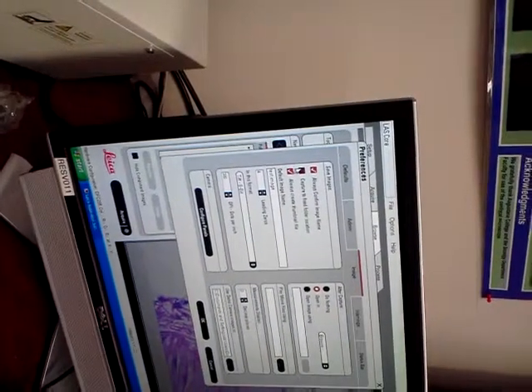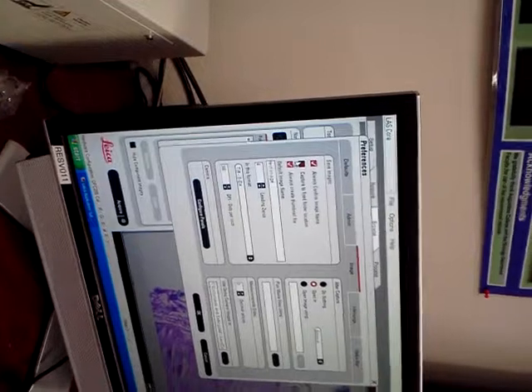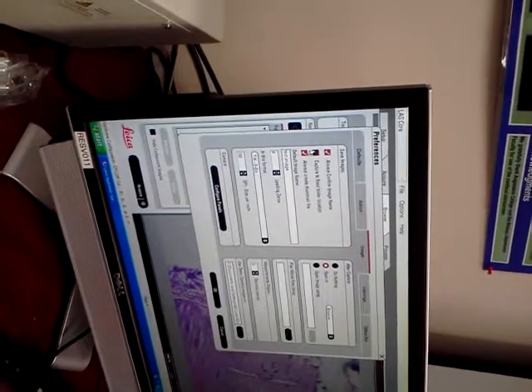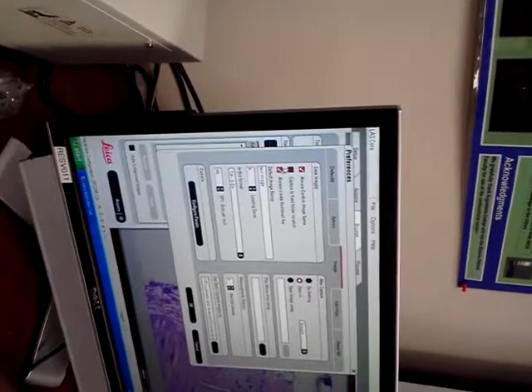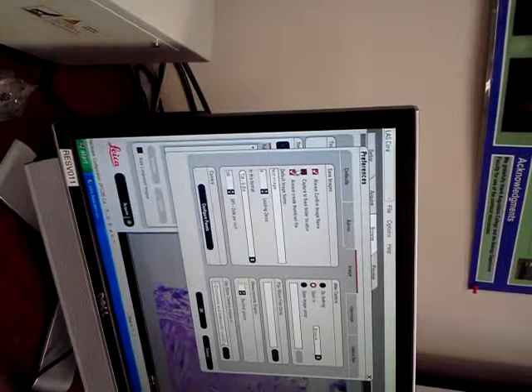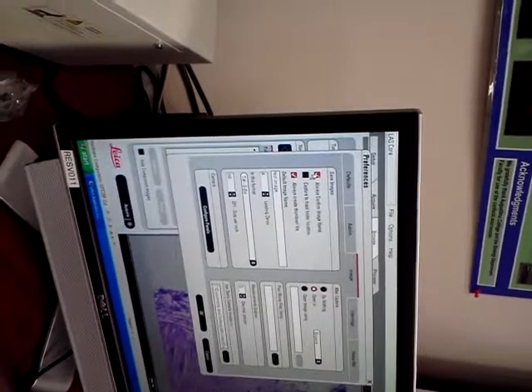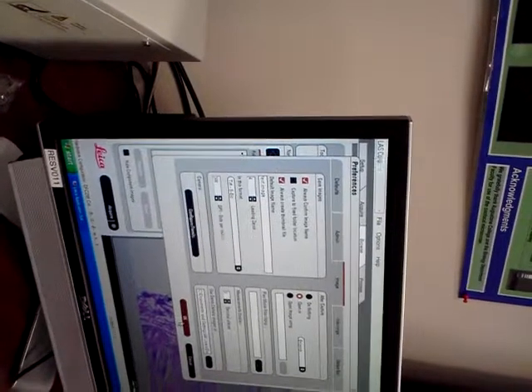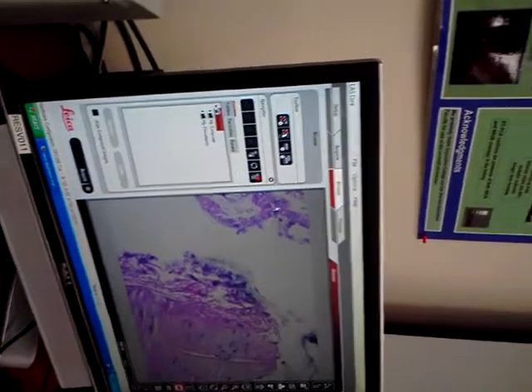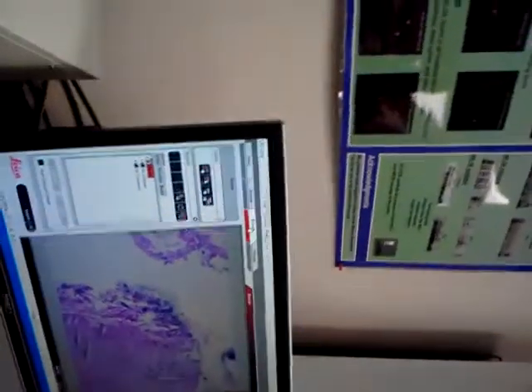Just make sure that everybody knows how to do it if you're going to do it this way, because that's where the issue comes of moving things around outside of LAS. I think it's smart to just leave it unclicked for now. If you did multi-users, then you've got to be careful with the moving and the deleting. But since we're having it prompt us every time, you don't have to. I just ran across that the other week, and it does not matter the way that we're doing it right now. Everything that's in Browse, you have in Process.